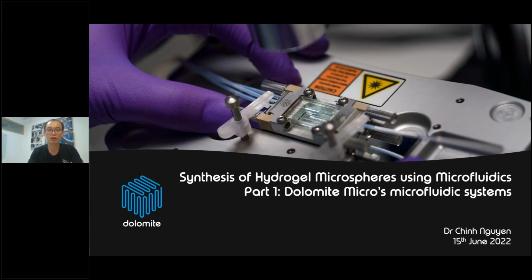So today we will talk about the synthesis of hydrogel microspheres using microfluidics. We are very honored to have Ms. Anna Cameron, a PhD candidate from the University of Queensland, join us as guest speaker today. She will be sharing about her research at the Shrink Group, focused on high throughput production of agarose and alginate microparticles for single-cell encapsulation of bacterial populations.